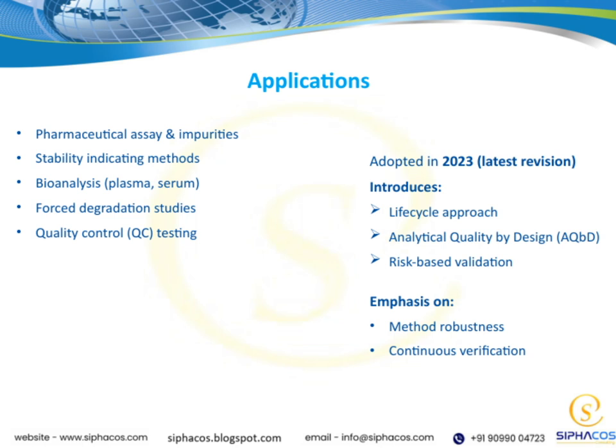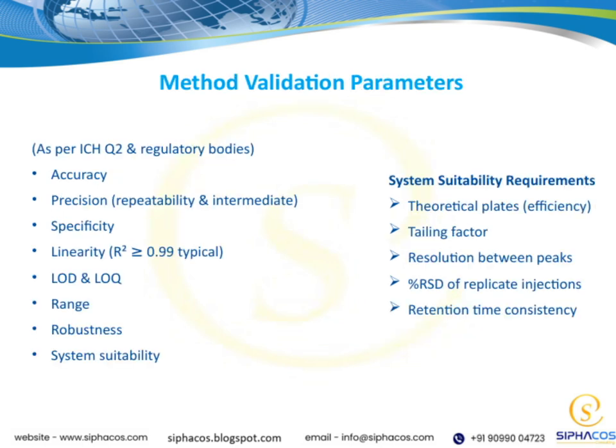Overall, these applications reflect our commitment to a science-driven, risk-based approach that enhances product quality and patient safety. Let's now look at system suitability requirements, which are essential to ensure our analytical method is performing reliably.